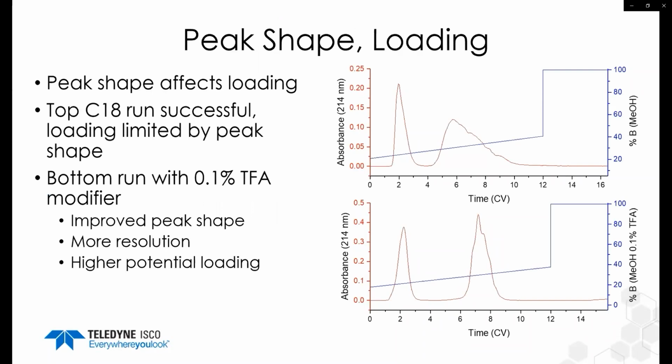If you need to add a buffer or modifier, run the scout gradient again because retention often changes, especially for ionizable compounds.